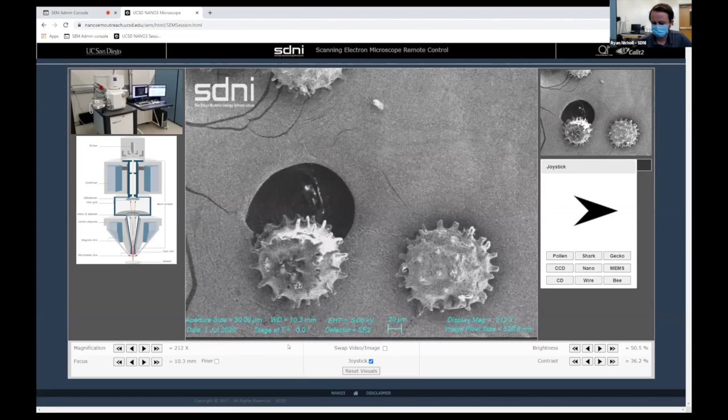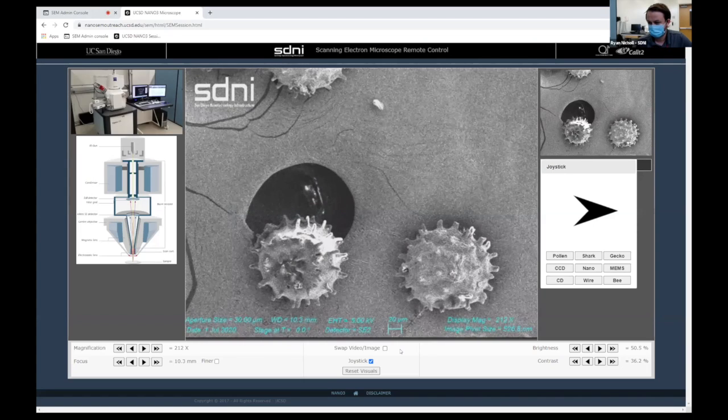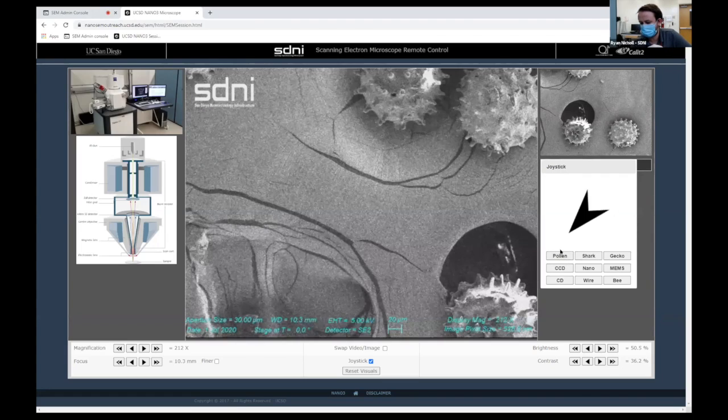Oh, okay. Yeah, that's okay for me, maybe. No problem. Okay, maybe I can click on. You can go somewhere else, yeah. If you don't want to do pollen, that's another thing.